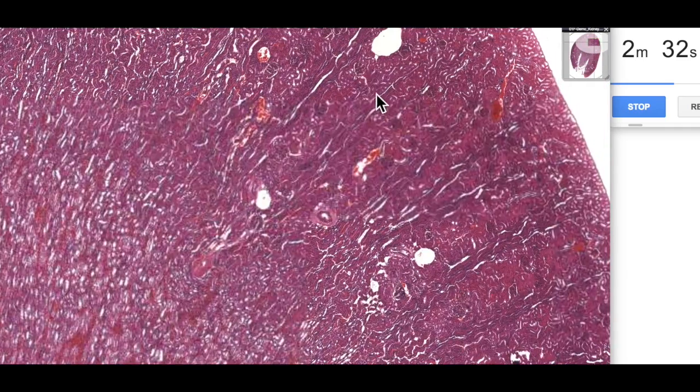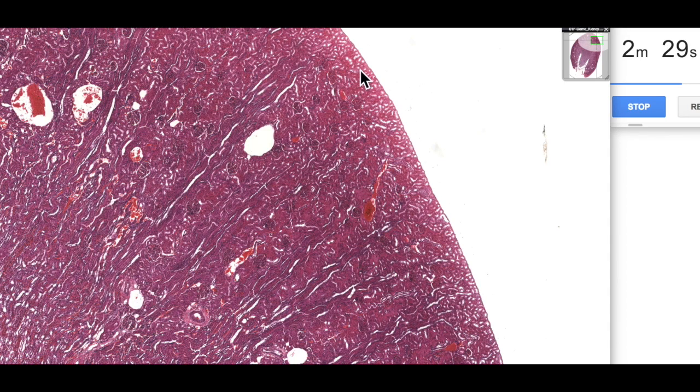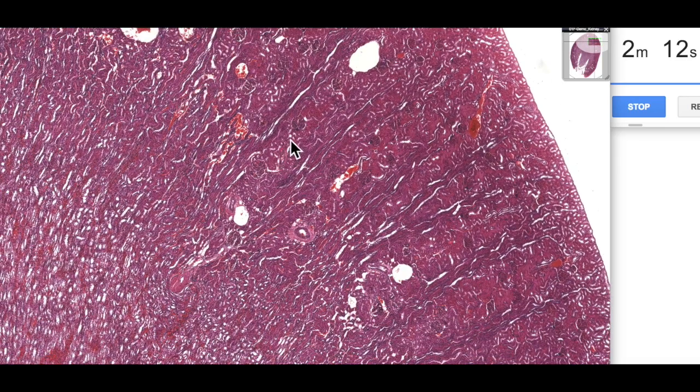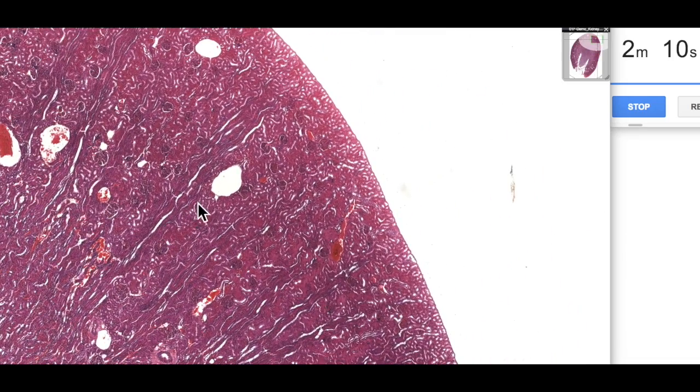But what we're going to be focusing on is the cortex, the cortical tissue here. And we can see just even at this low magnification the cortex is divided into sort of bands. We've got these stripy regions within the cortex and these are referred to as the medullary rays.